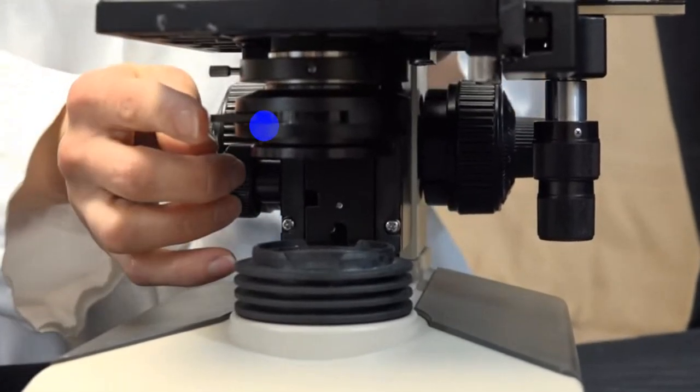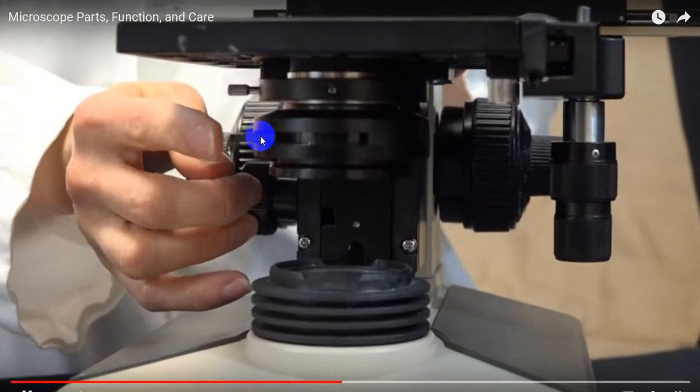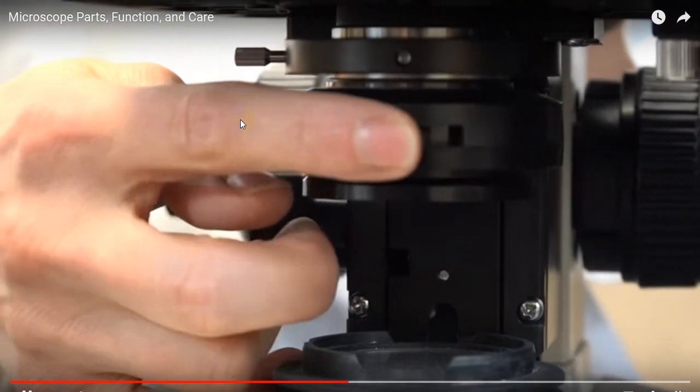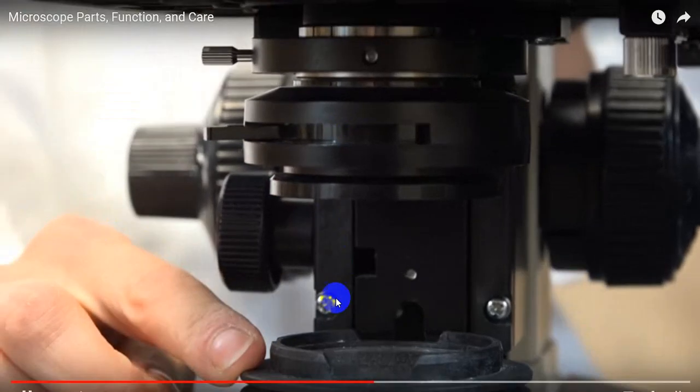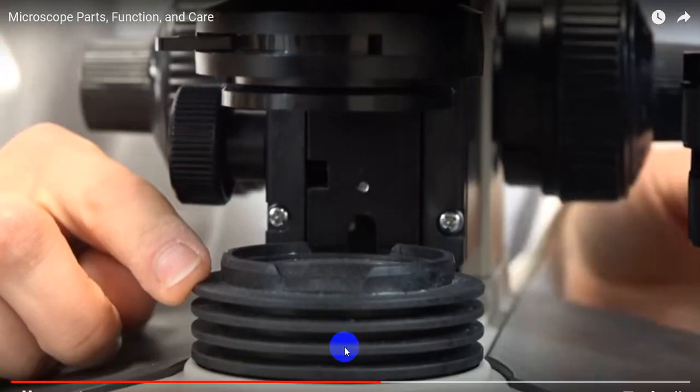On the condenser, there's also a small lever. This is the iris diaphragm lever, and it controls the amount of light that passes through the aperture, or the hole inside the condenser. Directly below the condenser is the light source.